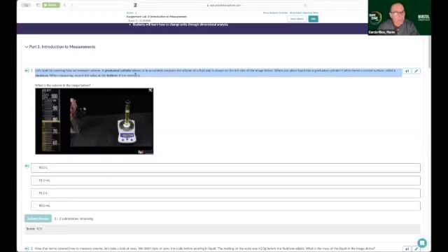told that a graduated cylinder is an instrument used to measure the volume of a fluid or of a liquid, that there's something called a meniscus, and that you're supposed to read the volume and take a best guess as to what that volume may be.